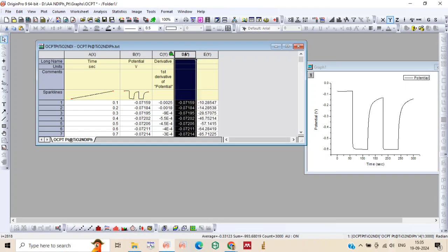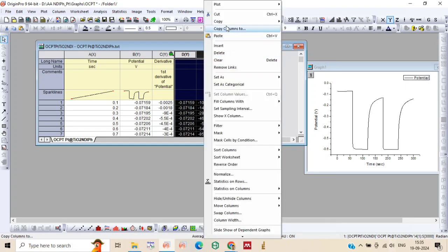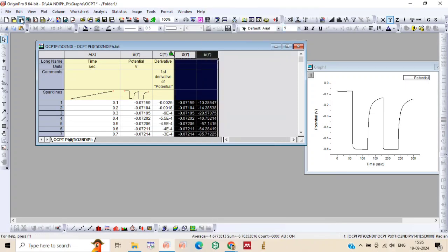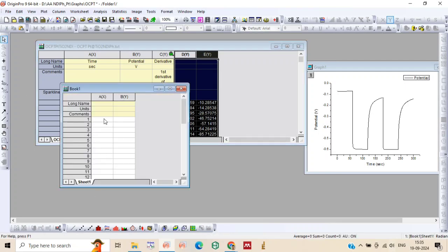Now just select these two columns D and E. Copy it and paste it in another workbook.